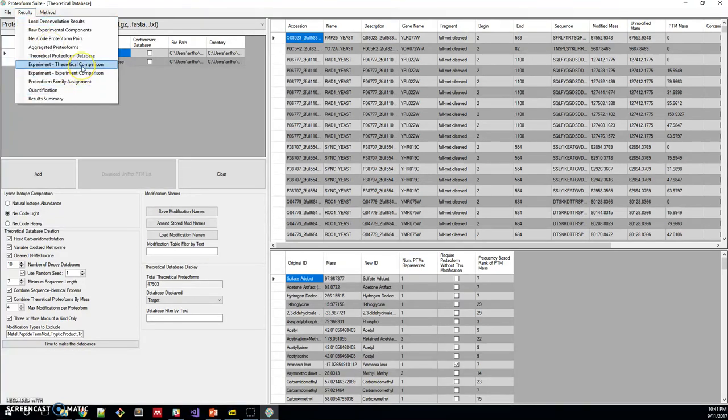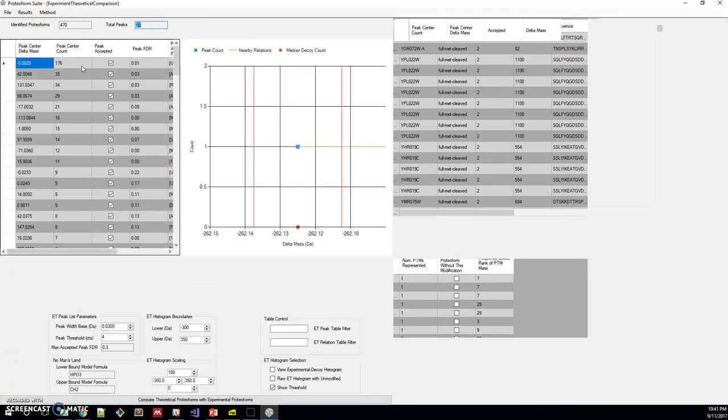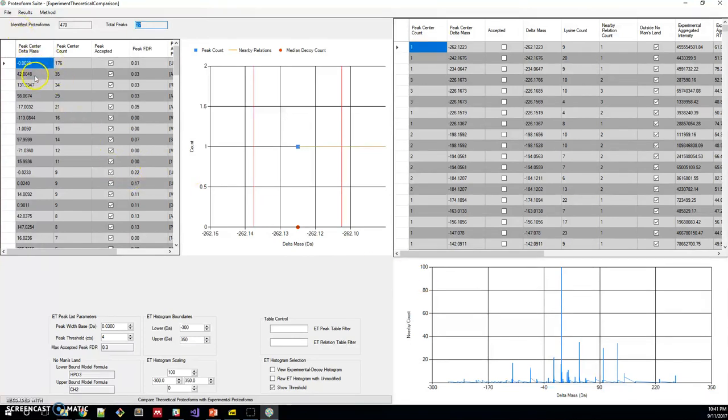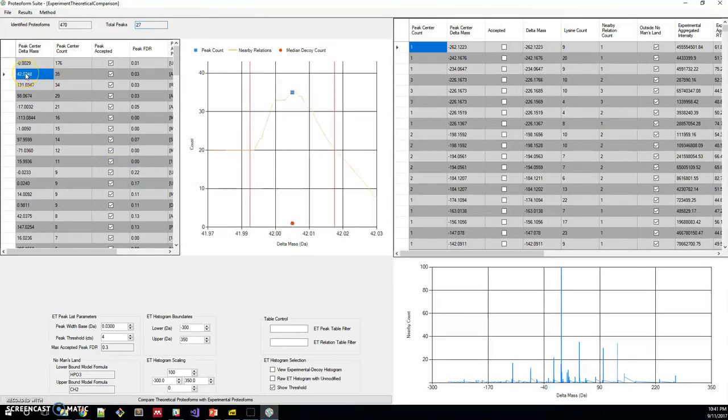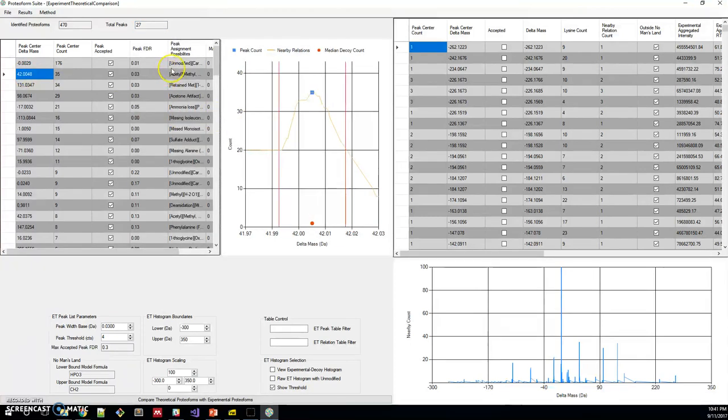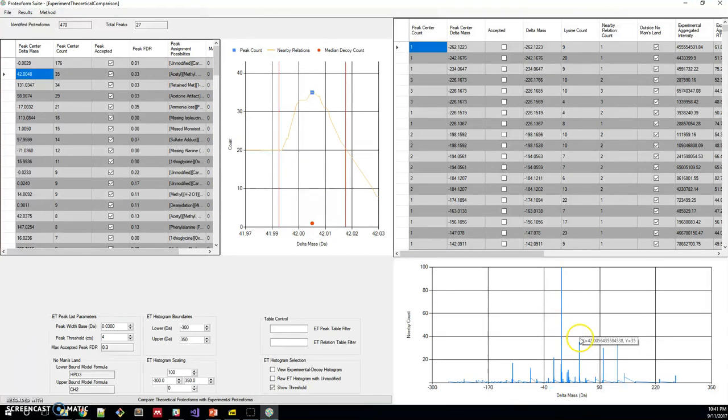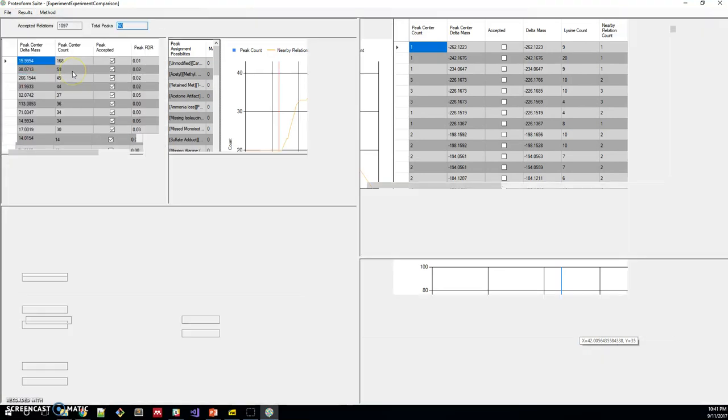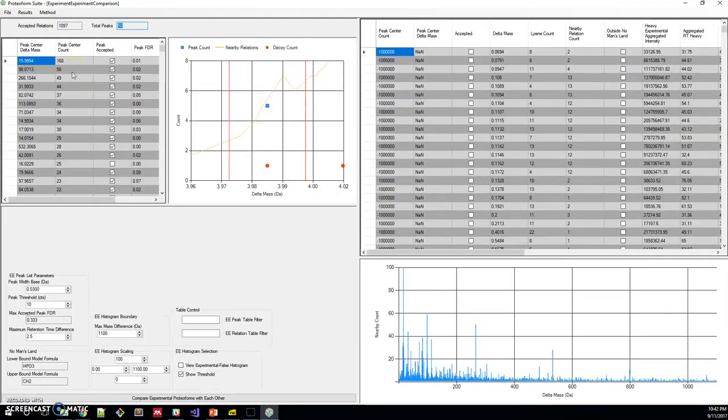Then we compare experimental masses to theoretical masses to get all sorts of mass differences that may be characteristic of known PTMs. You can see here that we have a peak mass difference of 42 that might be assigned to acetylation. You can find that peak here. If you click on this histogram, you can get the numbers to show up.